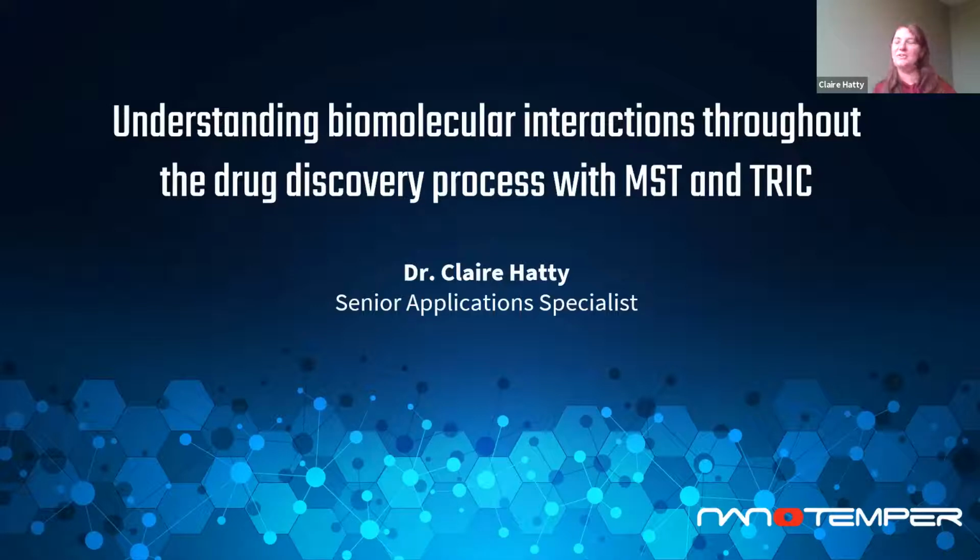Today I'm going to talk to you about understanding biomolecular interactions throughout the drug discovery process with MST and TRIC. I'm going to be talking about two main technologies in today's talk, which are MST and TRIC. It does say drug discovery in the title, so there'll be a little bit about drug discovery, but it's also going to be about generally how we can use those technologies for studying any sorts of biomolecular interactions. I've included a few examples that I think would be most relevant to you, so hopefully there's something in here for everyone.